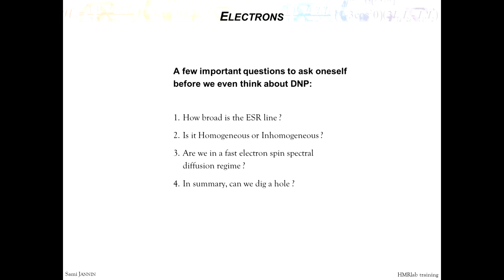Most of the theory that is developed by Vega, or Griffin and Fred Mentink-Vigier, is all about digging a hole. And yes, the effect of spinning is also super important, but it doesn't involve the spin temperature. Maybe it's worth noting that the spectral diffusion does not depend on temperature, or really little, while the T1 does a lot. Yeah, the T1 does a lot.